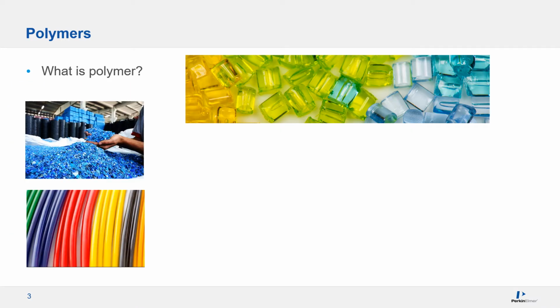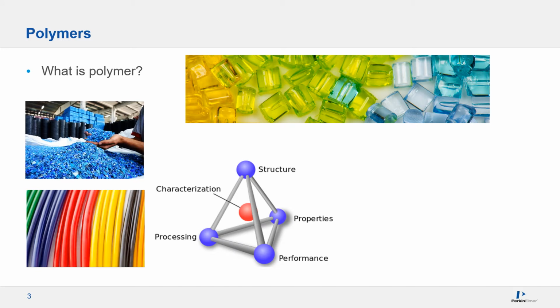If you are a material scientist or an engineer, you are more interested in the science behind it, making new polymers or finding new ways of using polymers. Your daily job is to deal with all the issues in manufacturing and processing polymers, raw materials and parts or final products, QA, QC, failure analysis. All these are centered around polymer characterization.